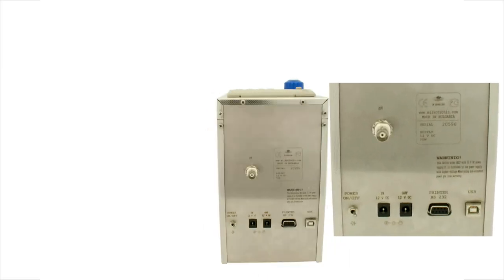Rear panel: toggle switch on/off, 12V input, 12V output for the printer, serial interface RS232 for connecting to a computer, USB optional, pH probe connector optional.